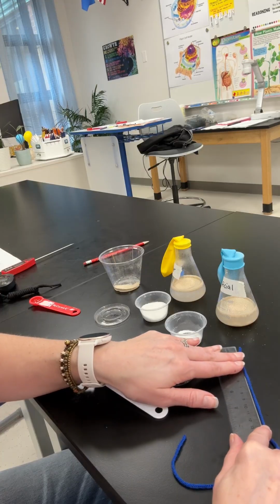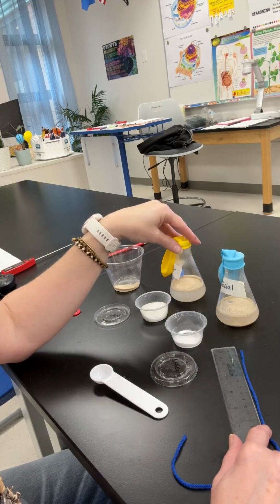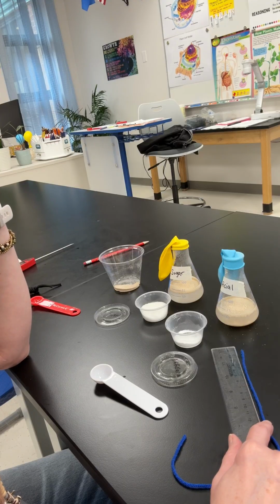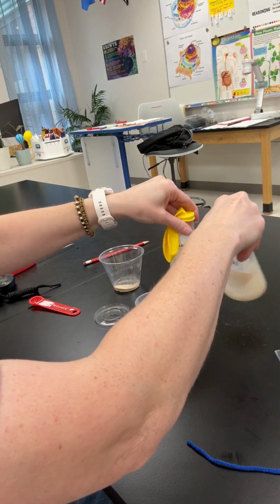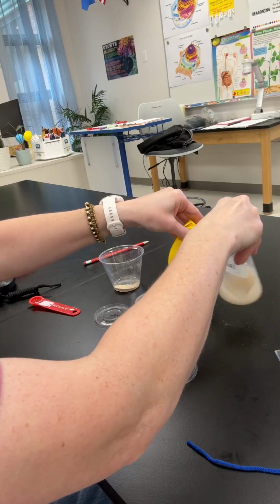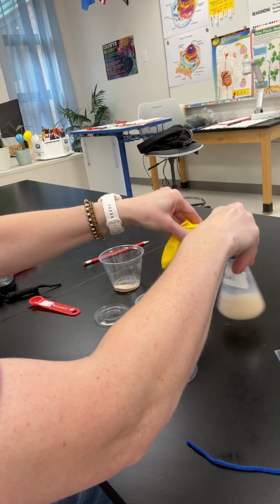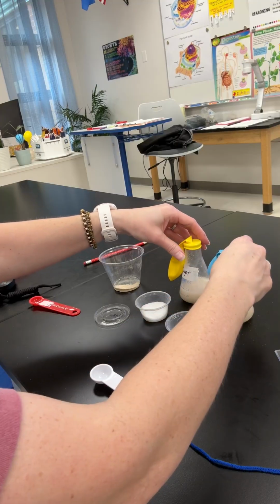On your papers, when you make your data table, you need to have your starting time, and the balloons are both going to be the same. They both have a starting circumference of 13 centimeters. Now, let me go ahead and mix these. Flasks are used for mixing things. I used a graduated cylinder to measure out the water. Okay, I think those look pretty mixed.